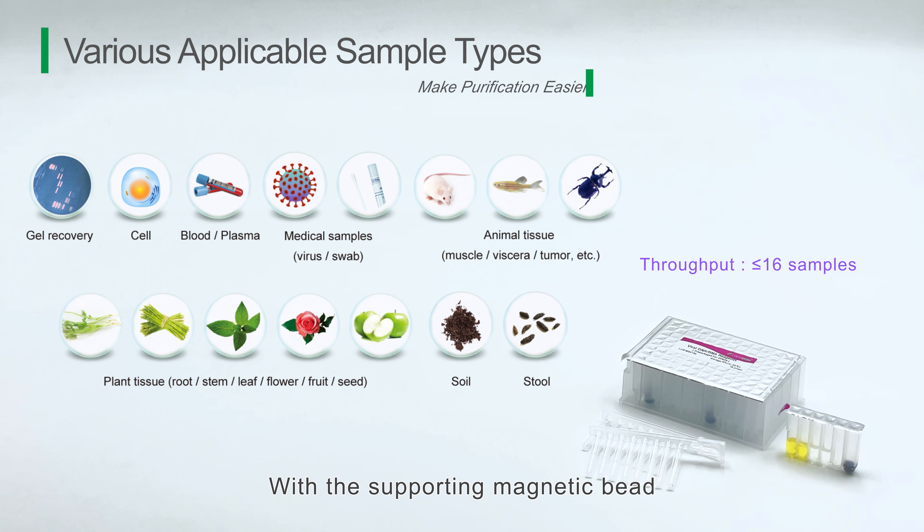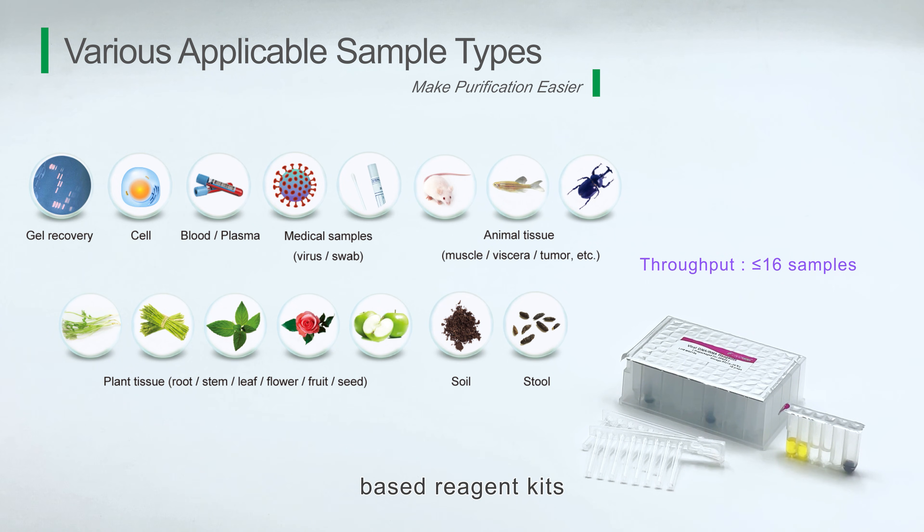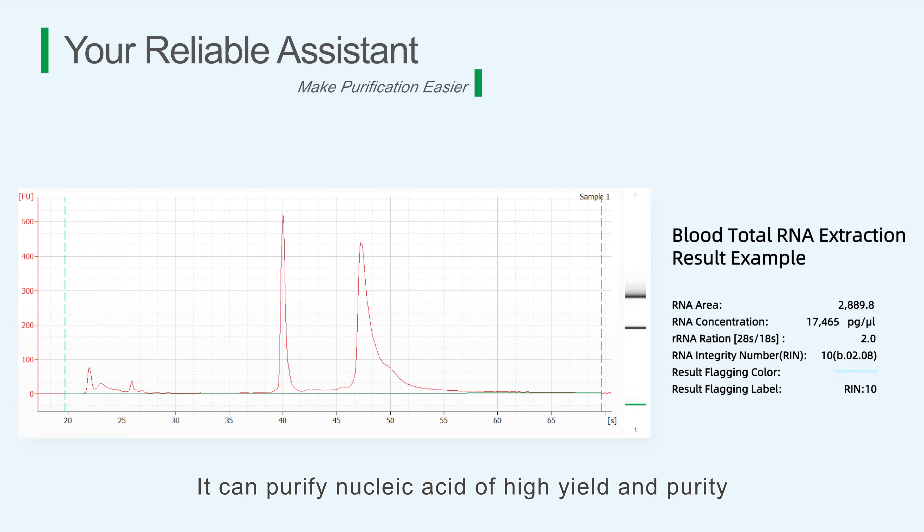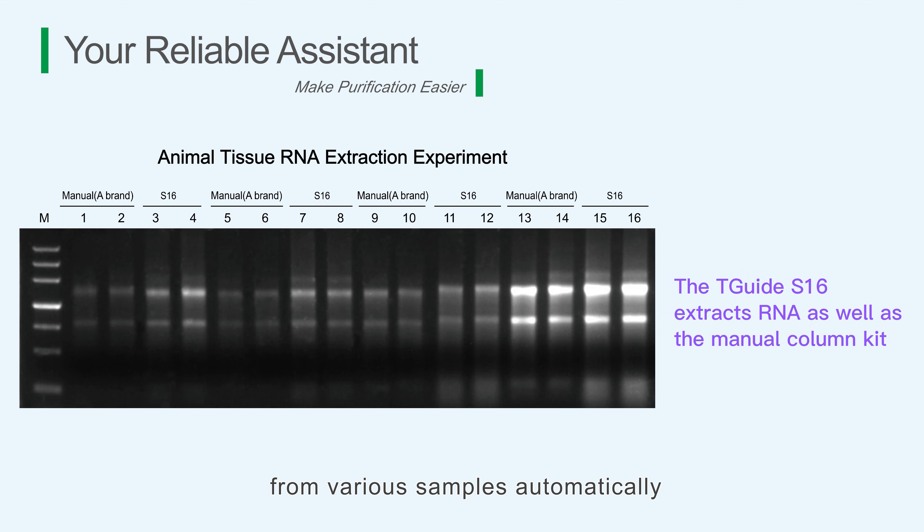With the supporting magnetic bead-based reagent kits, it can purify nucleic acid of high yield and purity from various samples automatically.